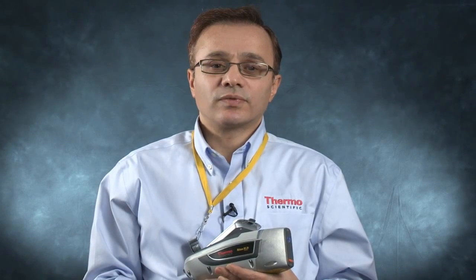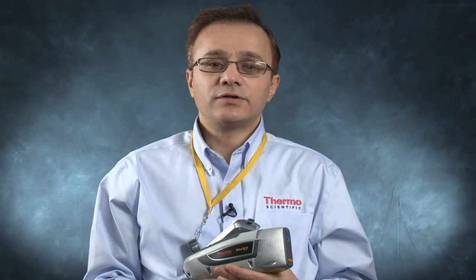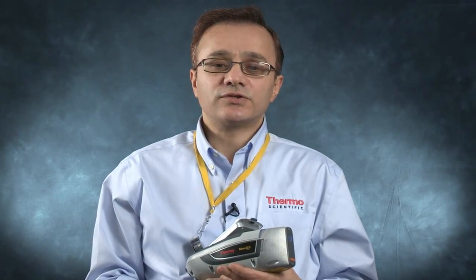Hi, I'm Ali Somerian, Chief Geologist at Thermo Fisher Scientific. I've been working in the mining industry for more than 15 years and have used these instruments during the past five years for ore exploration. I have also taught geology courses for more than 12 years in various universities.